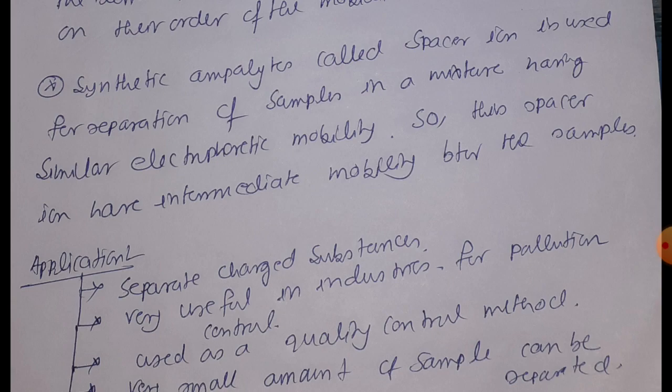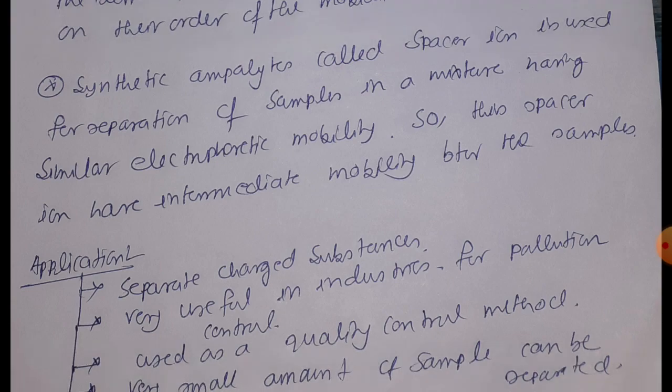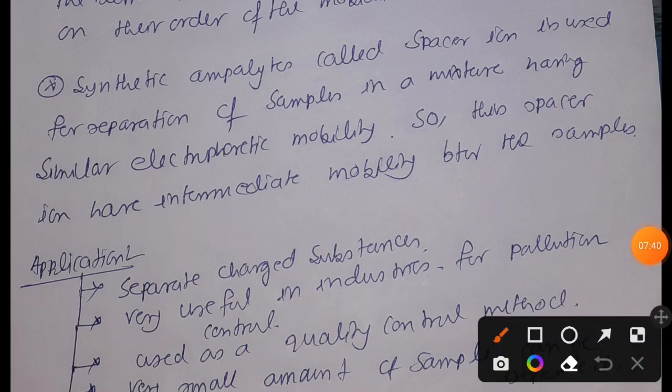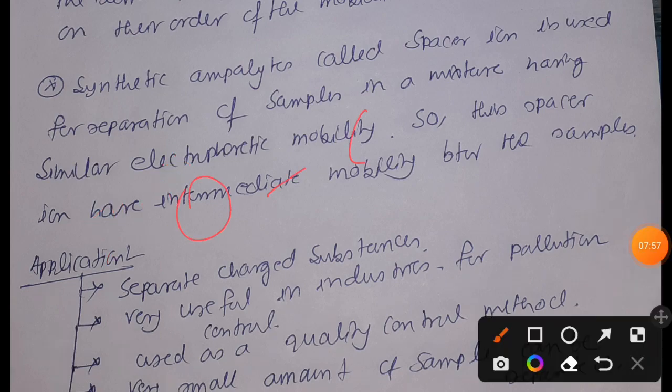So what can you do under such circumstances? Because normal isotachophoresis will not solve your problem, because they have too much closeness, right? Suppose in a football match, after 90 minutes the score is 0-0.